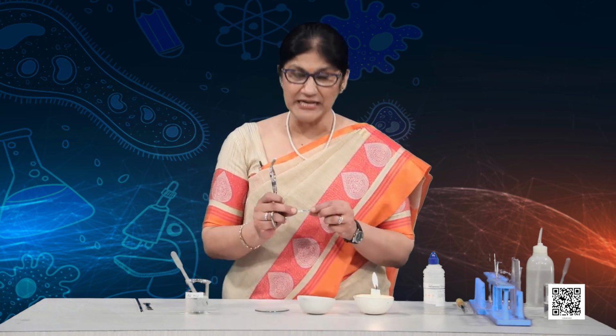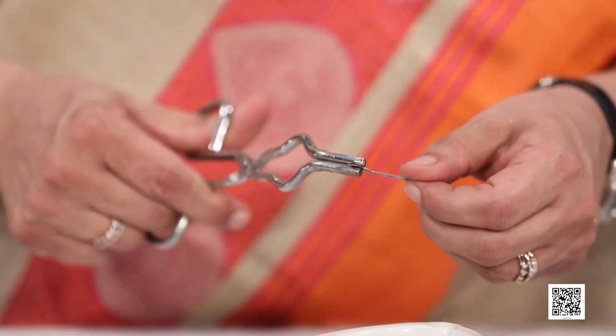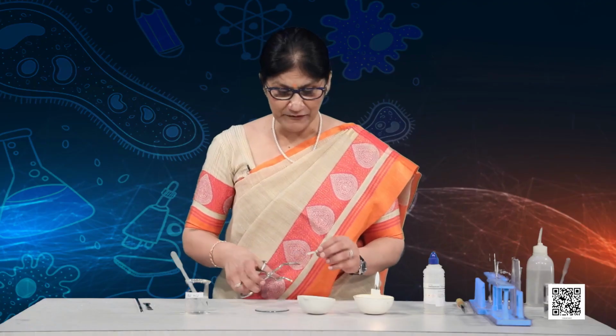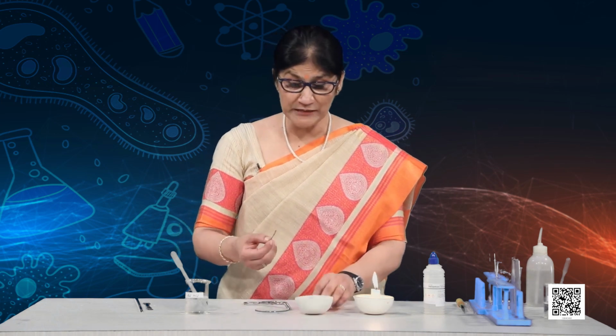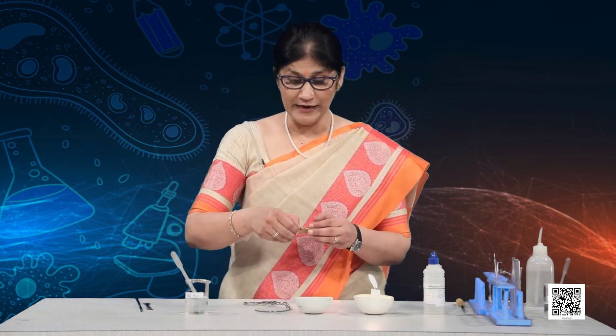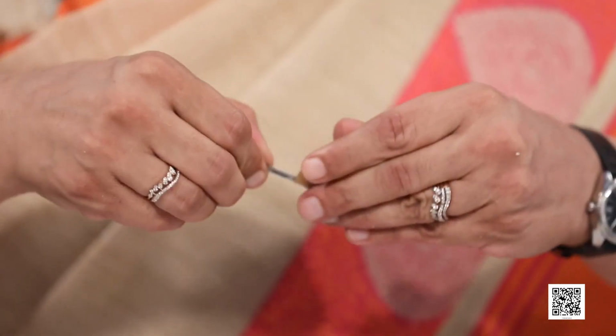We have this magnesium ribbon, okay? And the magnesium ribbon has got a black layer, which is a magnesium oxide layer. If I have to do the experiment, first of all I have to clean it so that I get a shiny surface.